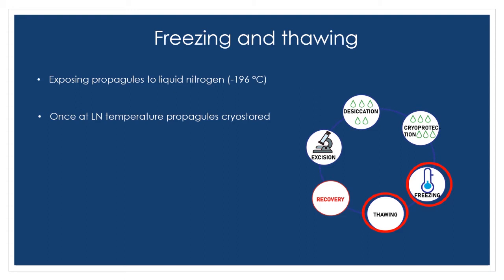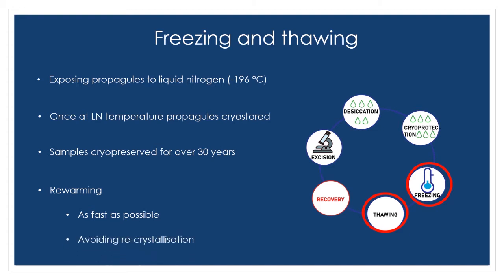And the next step is rewarming of our plant material. What we're trying within our experiments is to rewarm the propagules as fast as possible to avoid damages, as in to avoid the recrystallization of the water when it gets to the temperature of 0.